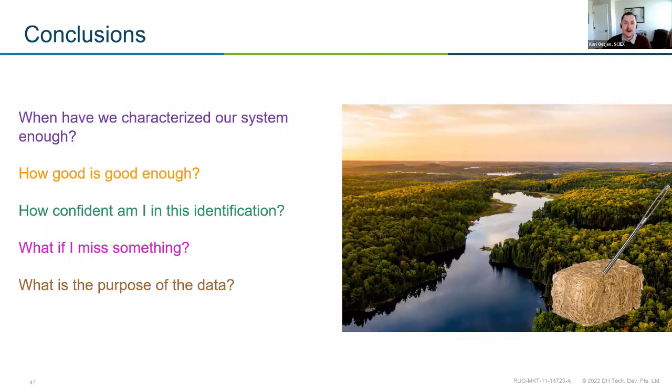But again, regardless of the systems, when we're talking about high resolution mass spectrometry, specifically non-target analysis, these systems are really complex. So eventually we're going to have to decide what's good enough. How much do I really need to characterize my system? That way we're not spending decades looking at a single sample.